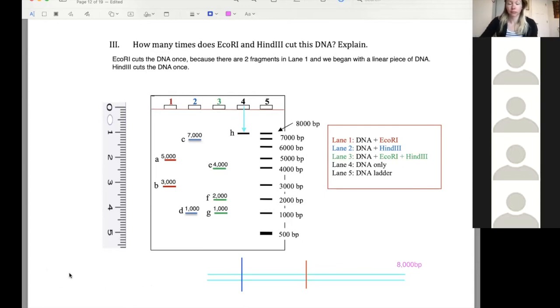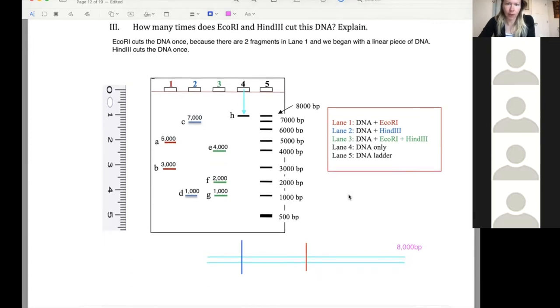Professor, I'm sorry again to ask this. I wanted to double check if I understand. Now that you have these values for each of the bands, my question is how you convert to millimeters. For example, C says 7,000. Right. So how many millimeters would that be? If we use this as our metric, it looks like 1.2, so it'd be like 12 millimeters maybe. Oh, I see. That is what I need the ruler for. Yeah, exactly. Okay, I understand now. Thank you.